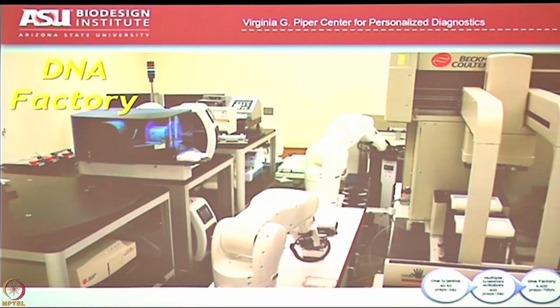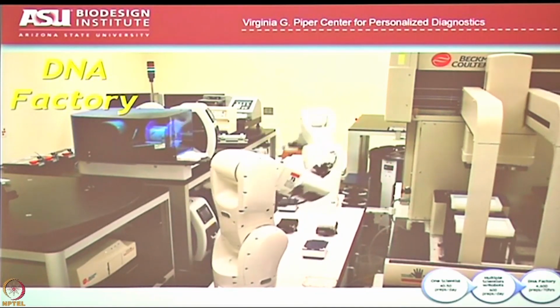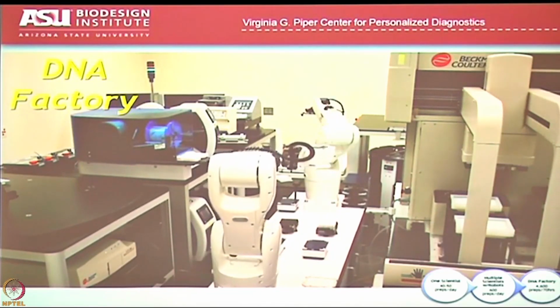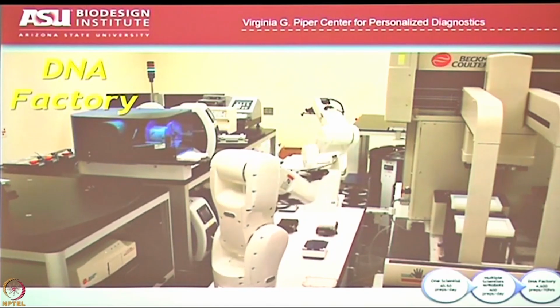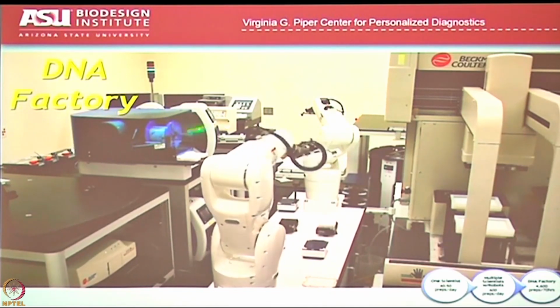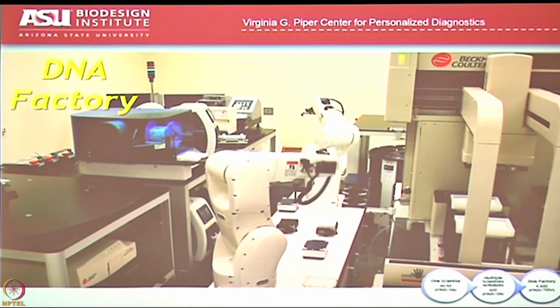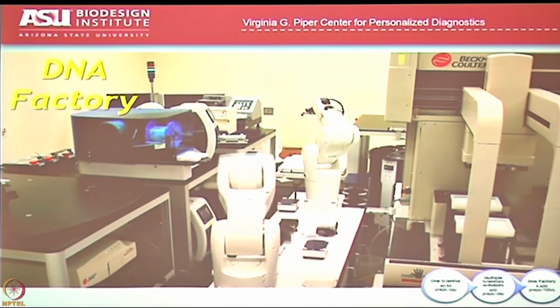But they can pass it back to the centrifuge, which is right there. There's also a freezer, which is right over here, that stores the pellets after they've been grown. And then this liquid robot over here will purify the DNA from the bacterial pellets. You can see this guy's mixing by turning it upside down, just the way you would invert a plate. Right? So the robots can do that for you if you want them to. And of course, we have sealers and peelers to seal the plate so they don't spill. There's a barcode reader right down here, which you can't see, that checks the barcode of every plate to make sure that it's what's supposed to be.